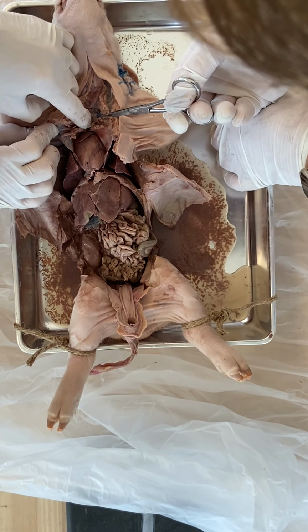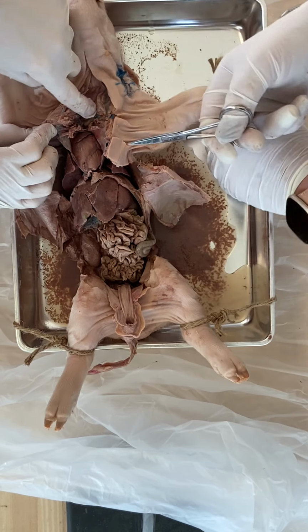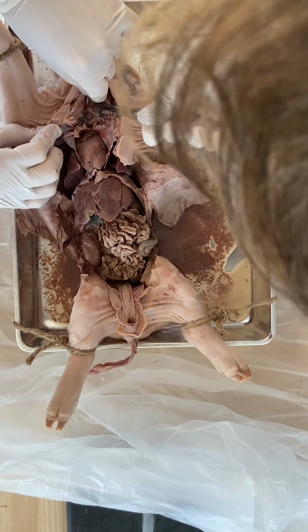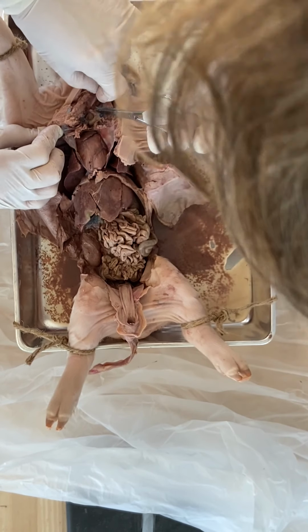Okay, what are we getting into? Is that blood vessels? Looks like it. Because you can feel the trachea. Oh, I can. Is it there? It is. Oh, no. It's right under there. It's right in there. There we go. I thought I could see some ridges. Yes, this might be like the thymus gland and stuff that's in the neck. So you get your thyroid and your thymus. There we go. Yeah. There it is.